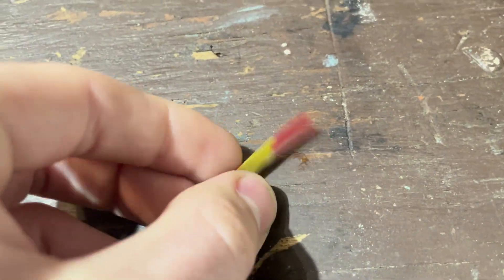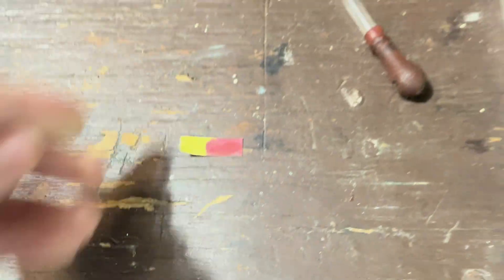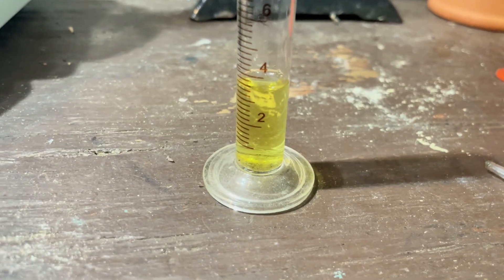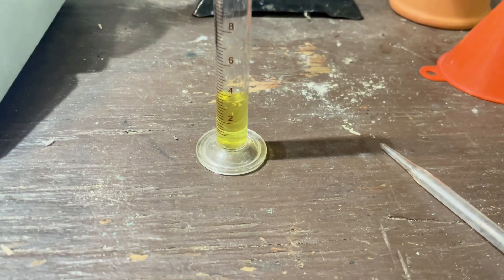Very acidic. Very good. I'm going to note this down, and then I'm going to do some calculations, and I will come back with how much nitric acid my setup will make per hour.